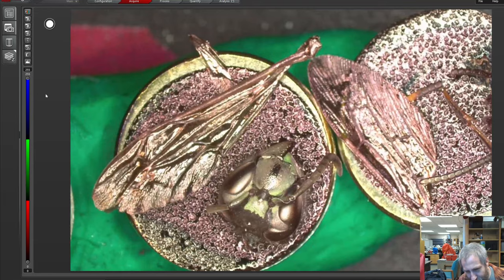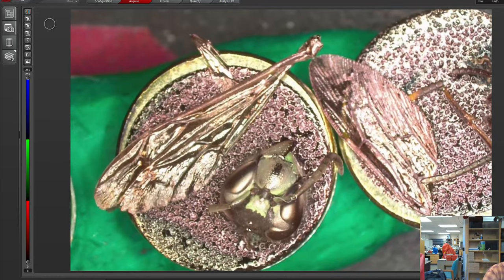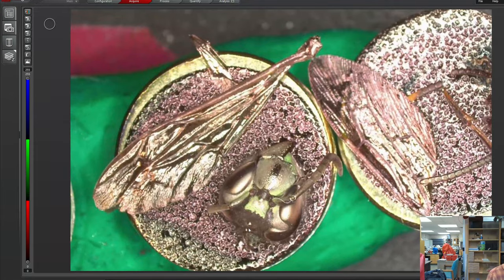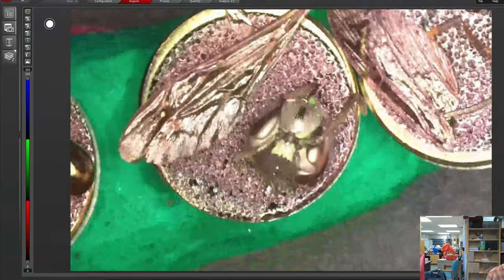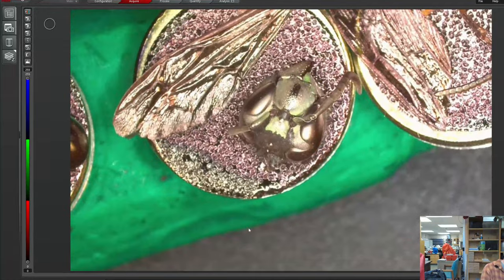And you can see there the hornet's head, and these are the mouths. They have sort of like one folds under and one folds on the outer edge. And then this is sort of like their compound eyes here. These are obviously antenna. And then there's three little eyes right here on these as well. The same three eyes, functionally the same purpose is served by those three eyes as the three eyes on the locust, the cicada.